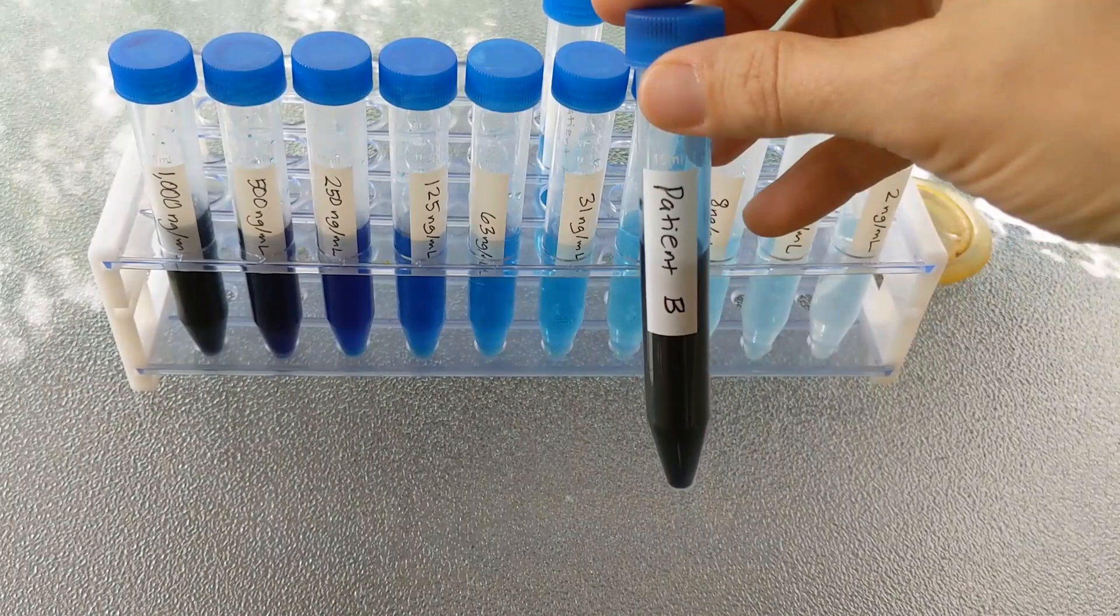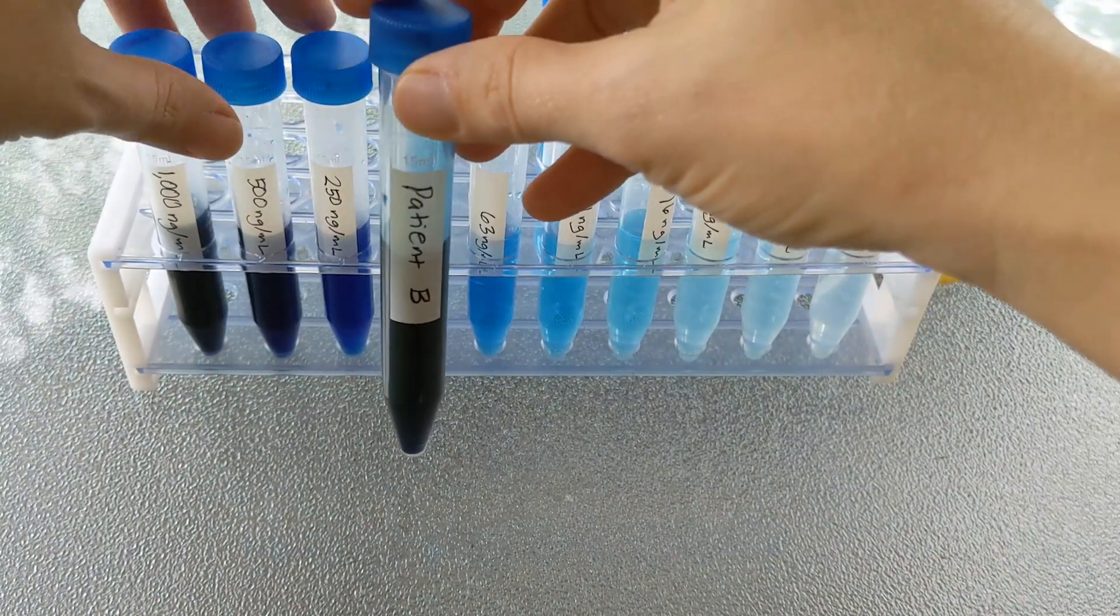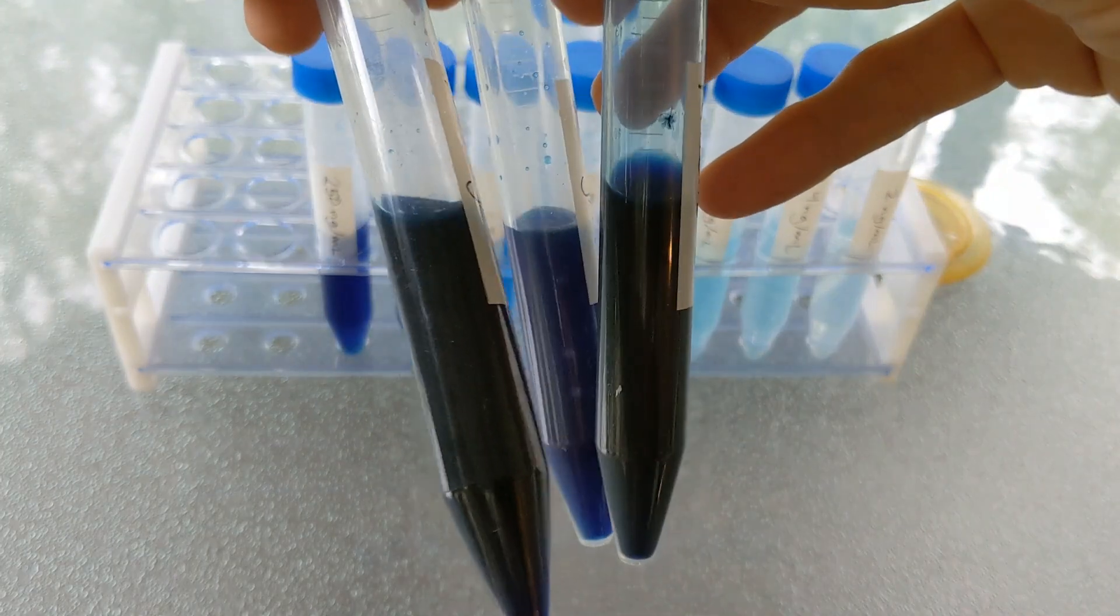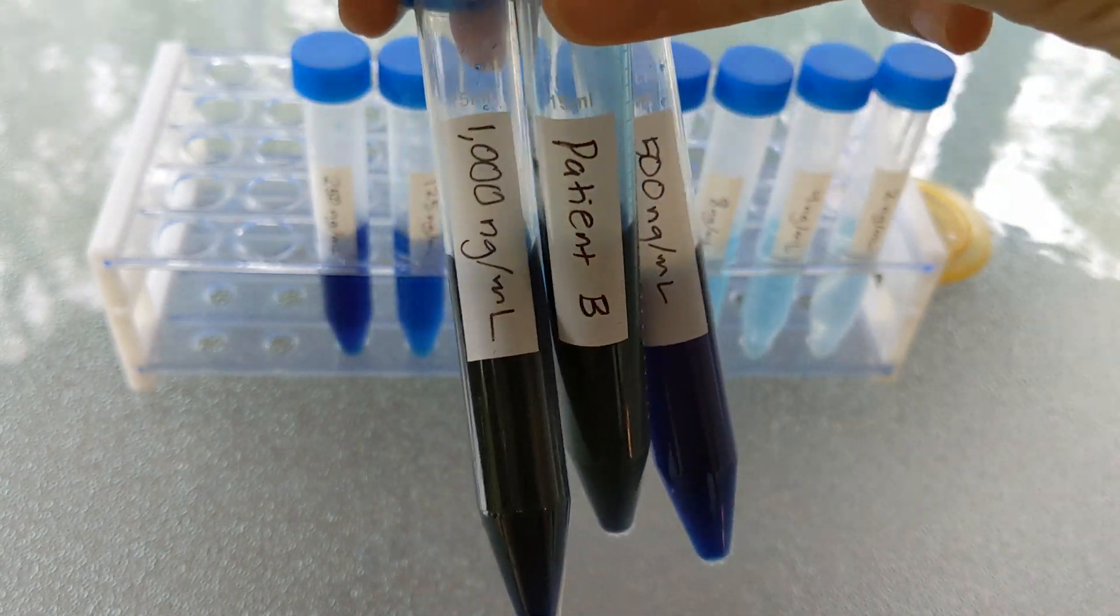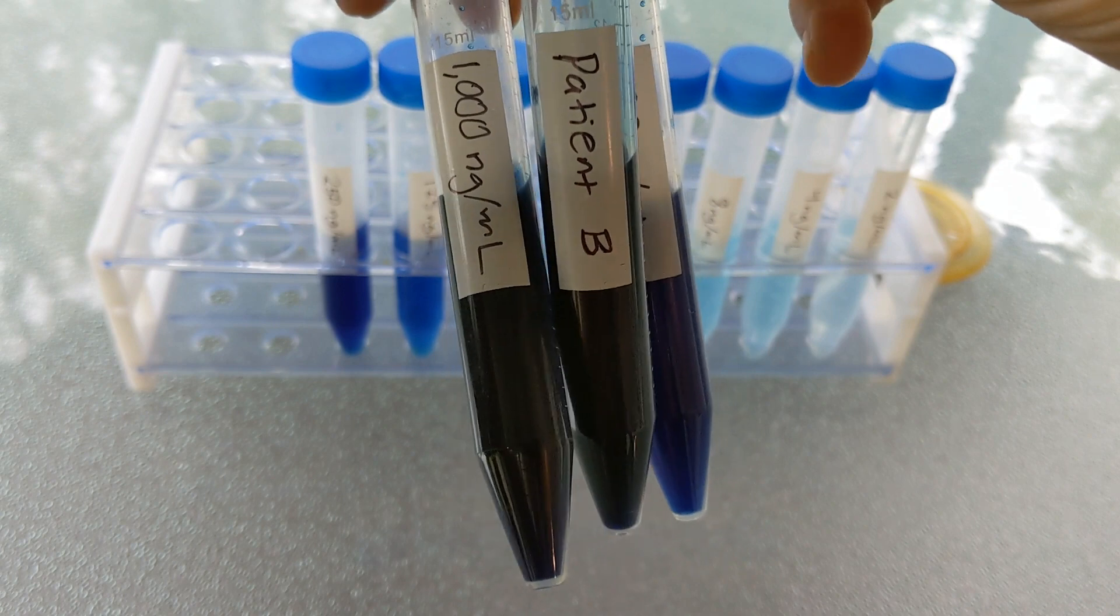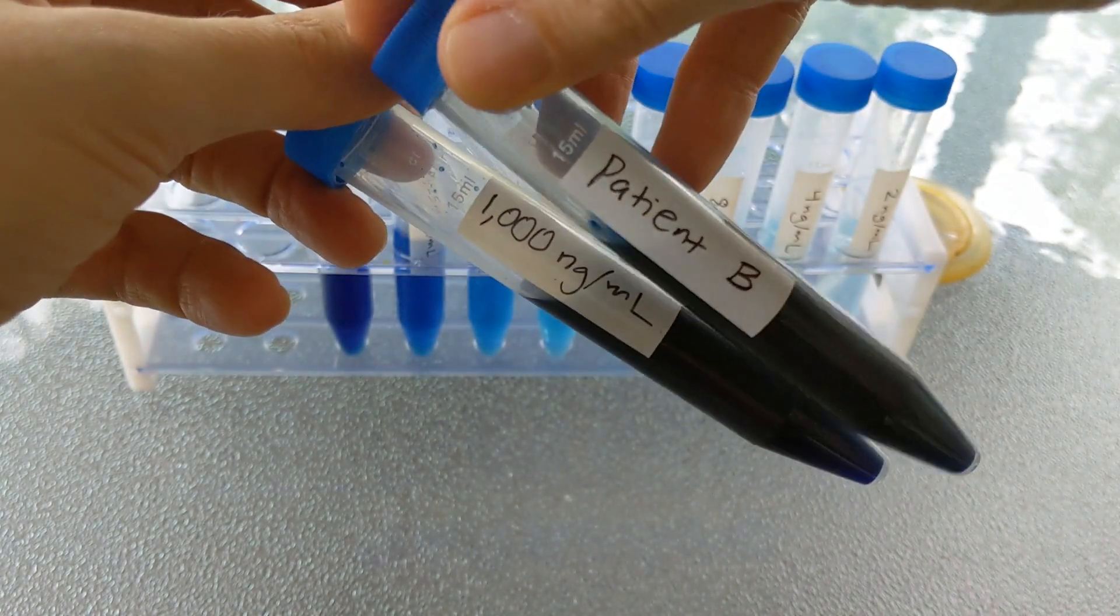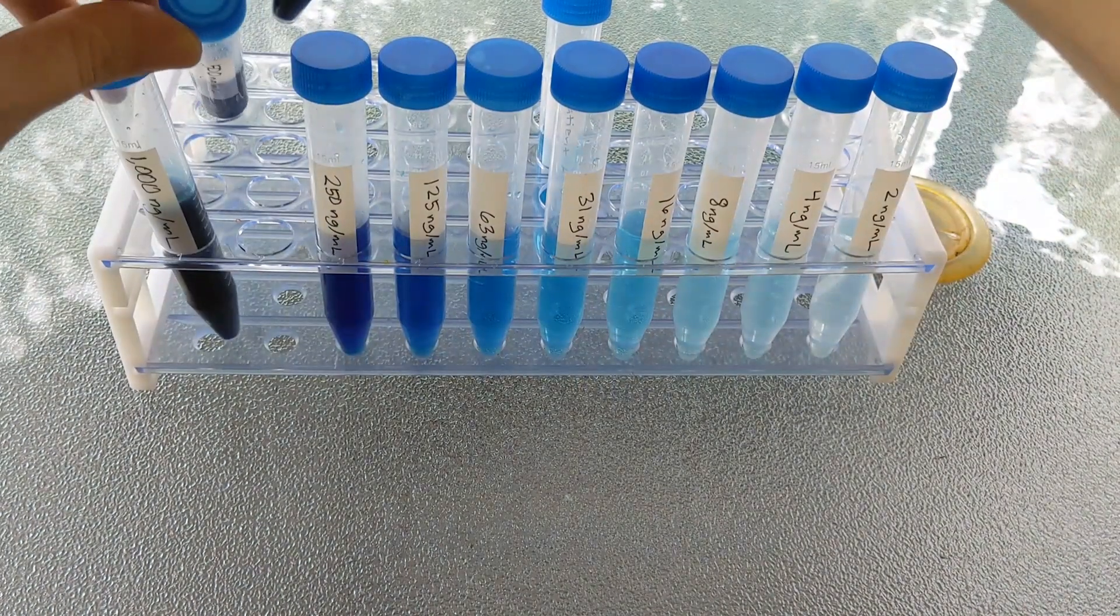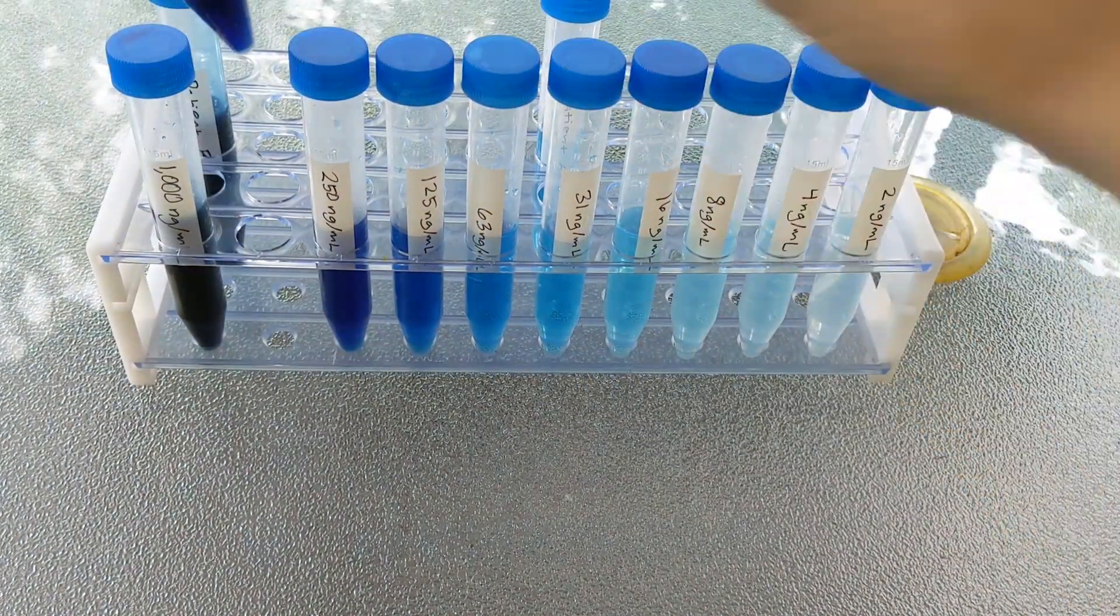And then I have another one to test out. So this is patient B, clearly very dark, very infected patient, but how dark and infected? I think it's more of a match for this first tube. So I'm going to call patient B 1,000 nanograms per milliliter. And I'm going to put that patient right there.